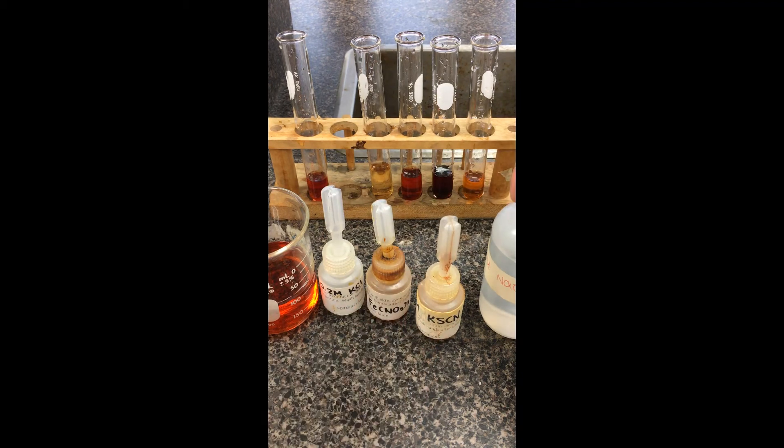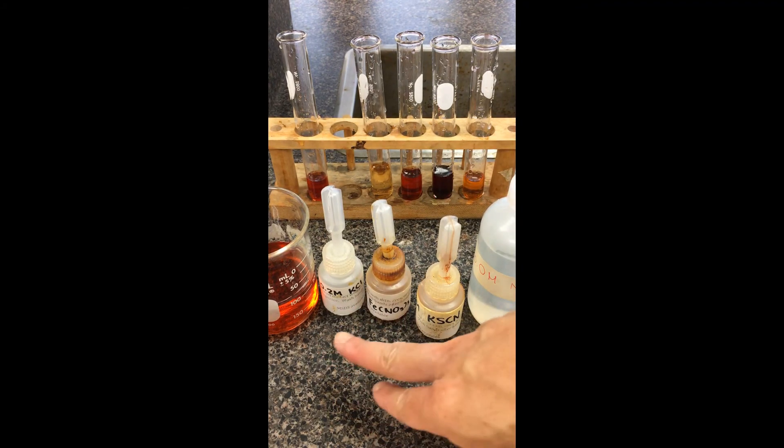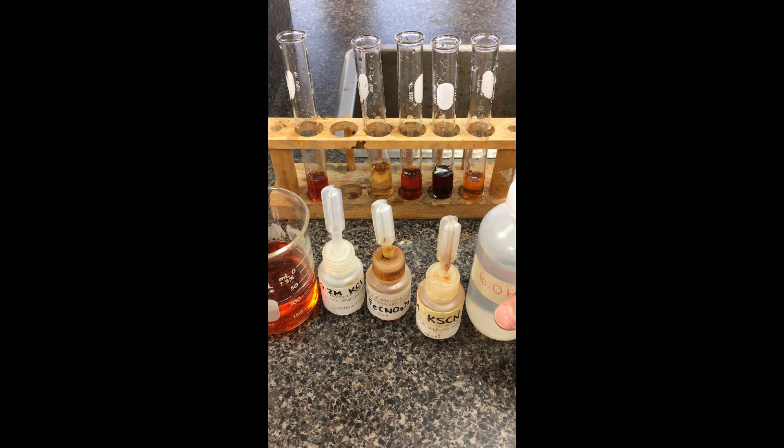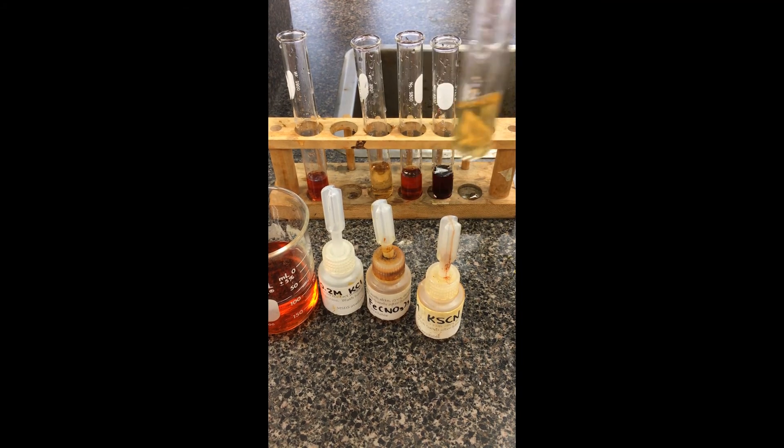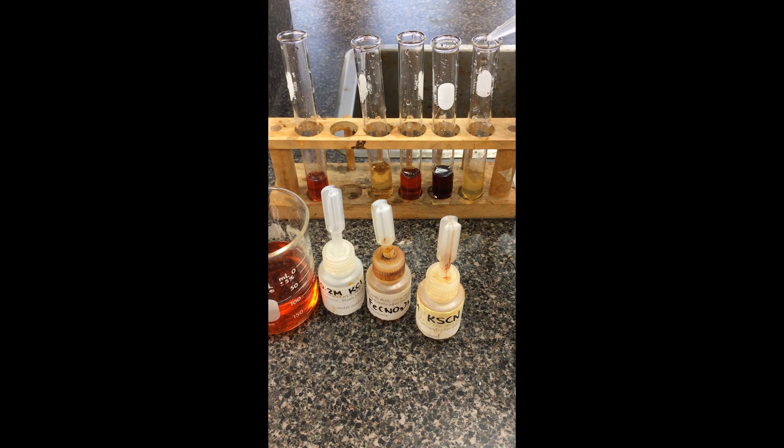Lastly, the sodium hydroxide — it's fairly concentrated compared to the others. These are only 0.2 molar, but this is actually 6 molar. Let's see what happens in this last container — give it a little squirt. Not only is the color lighter here, you should be able to see a precipitate forming. There will be a question about the identity of that precipitate. Adding a little more sodium hydroxide — it's getting cloudier, and definitely a different color than what we had initially.